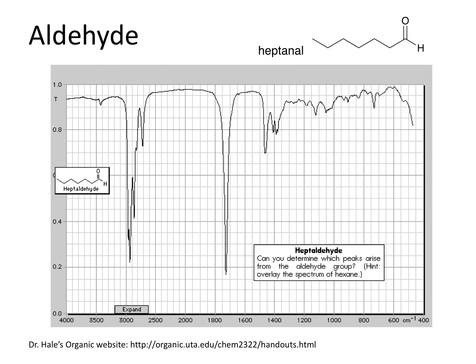All the other carbonyl functional groups should have an extra peak. They should all have a carbonyl, but then something else. So the first example would be an aldehyde. An aldehyde has a carbonyl, but it also has a special hydrogen on the side.